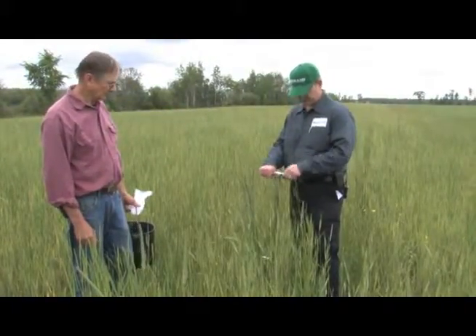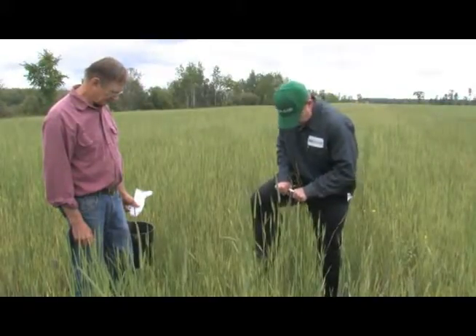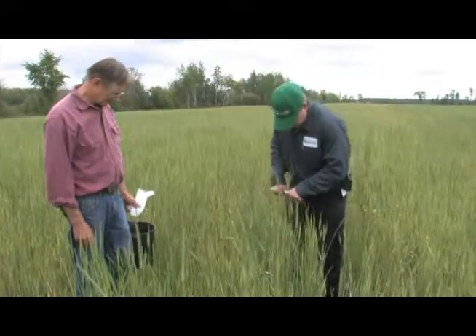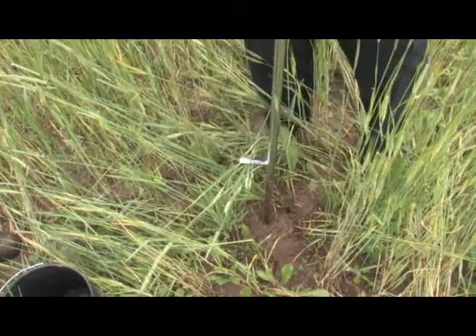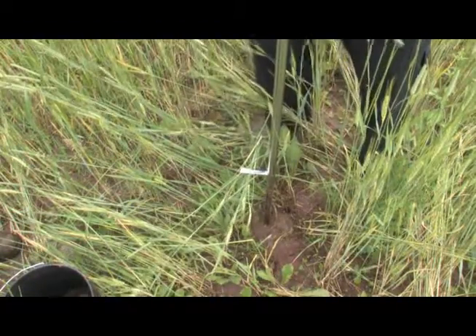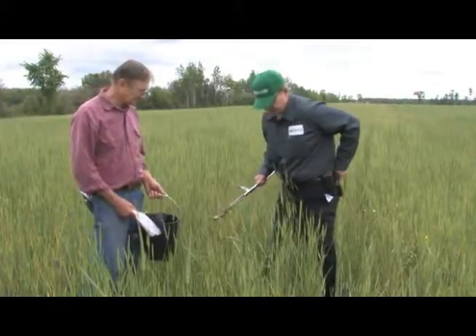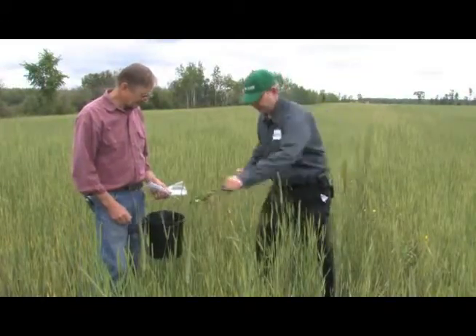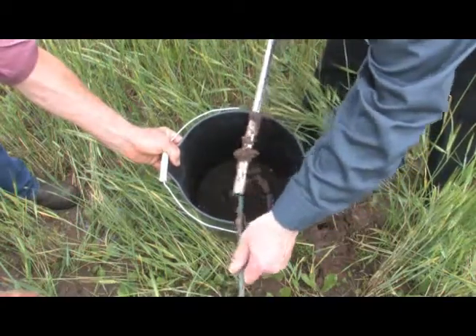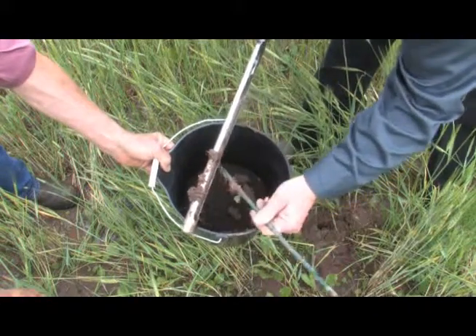All you have to do is take the probe and push it down by hand, or if you're a little lighter weight, you might want to push down with your foot. You go down to the area marked by the tape, and in this case, we have a very wet, heavy soil. And here's a soil sample, and we take our rod and then put it into the bucket and place it in here.